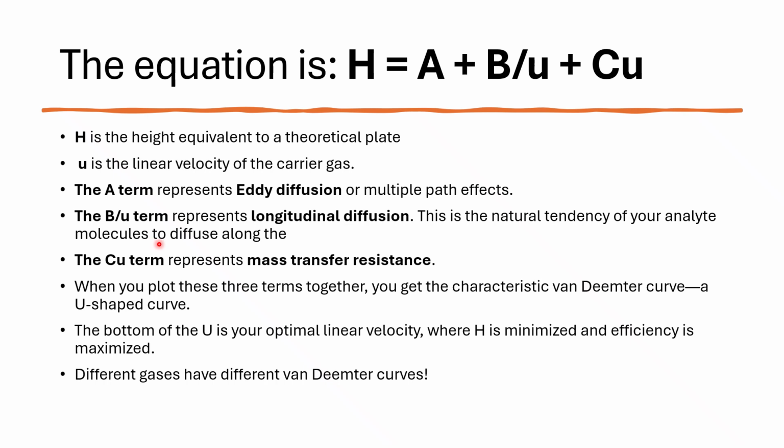Now coming to the B/u term, it represents the longitudinal diffusion.